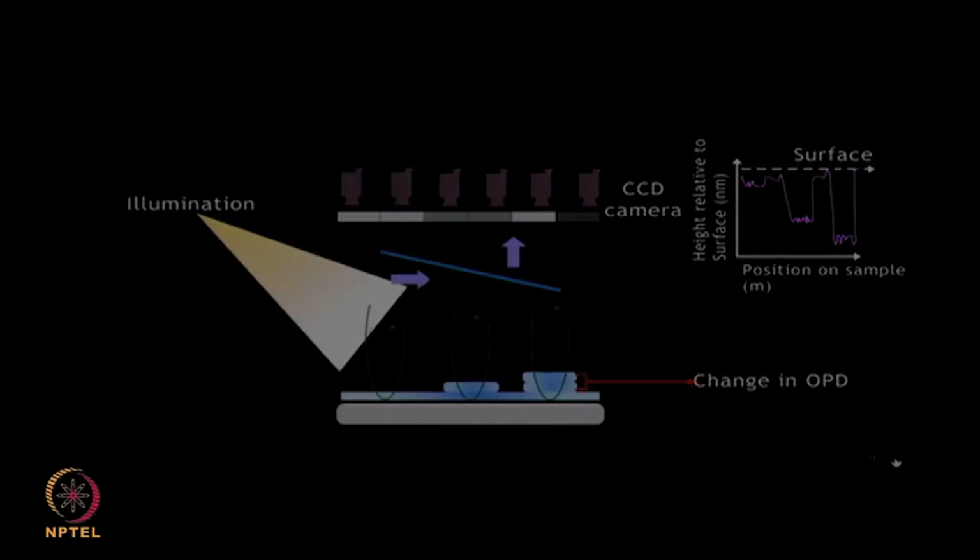After discussing many label free techniques, now I am going to show you an overview of some of the sensitive label free platforms which have potential to be coupled with microarray applications. Though we have discussed some of these approaches and principles in detail, it was not possible to discuss these in the context of microarrays.